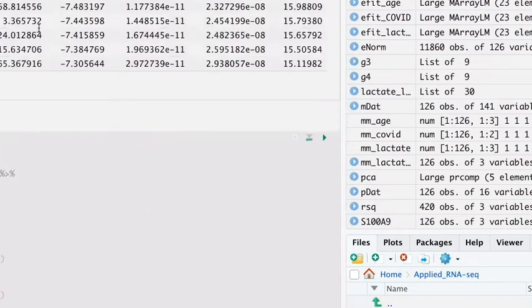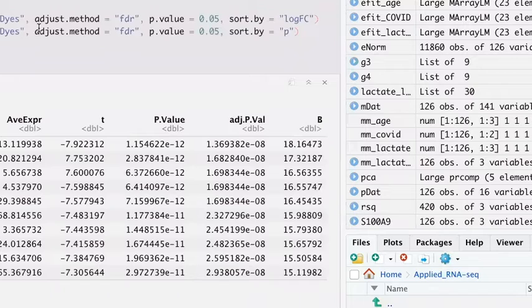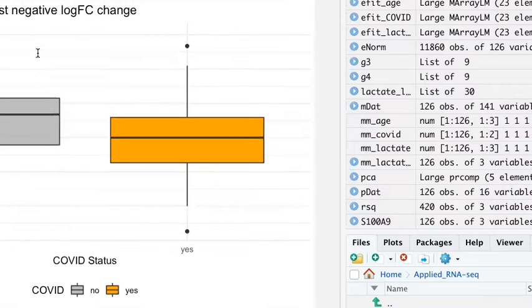Yeah, you make a very valid point. A typical log2 fold change, you're looking for it somewhat centered on 0, hovering around. A log2 fold change of 1 is 2-fold different, so if that was 2-fold different in your average expression, then you'd expect one at 15 and the other at 30. I think I've seen this sometimes happen when there are really big outliers, as we can see over here. That does influence it a bit.